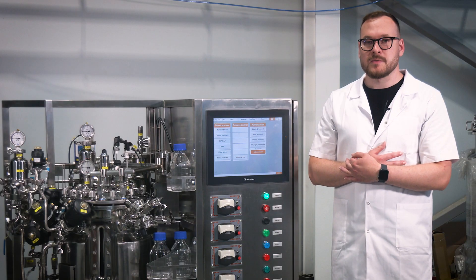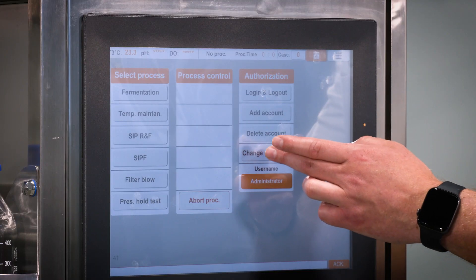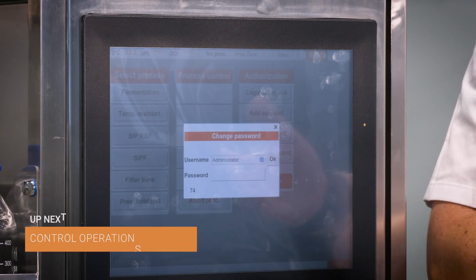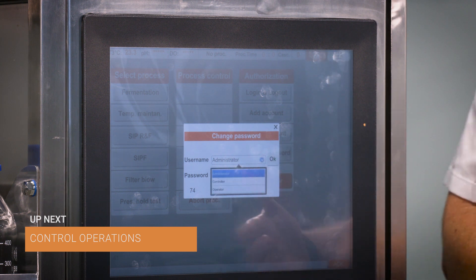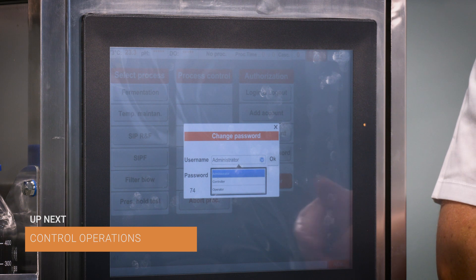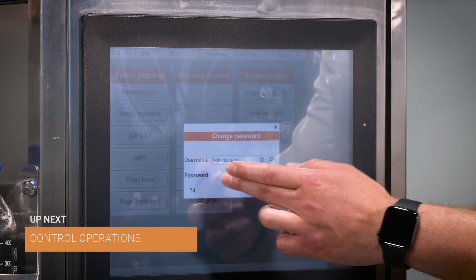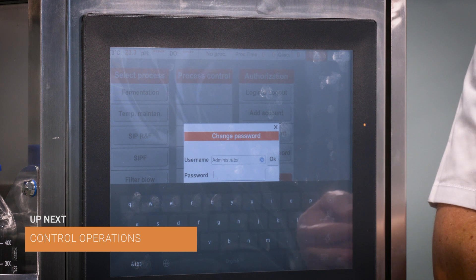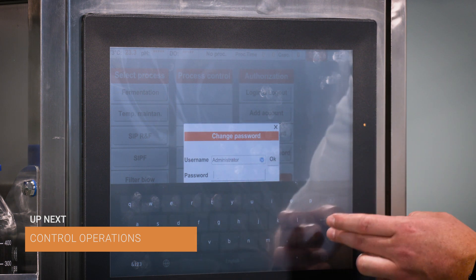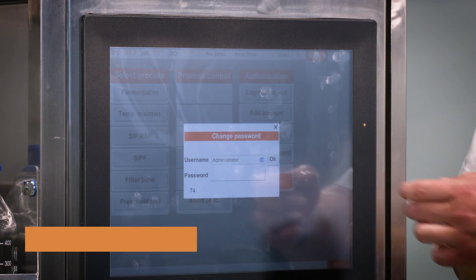Changing passwords: Press the set password button and the pop-up window will appear. Select the desired user name for which you need to change the password. Enter the new password into the blank space and confirm your action by pressing the OK button.